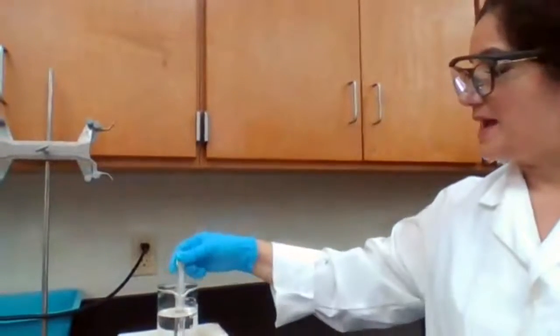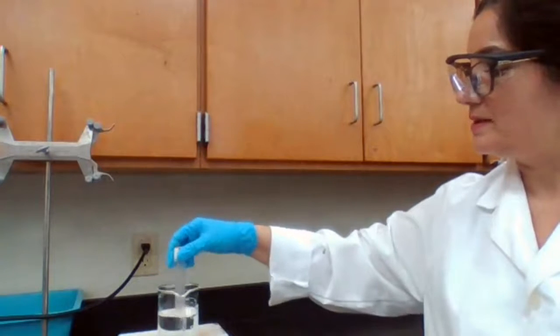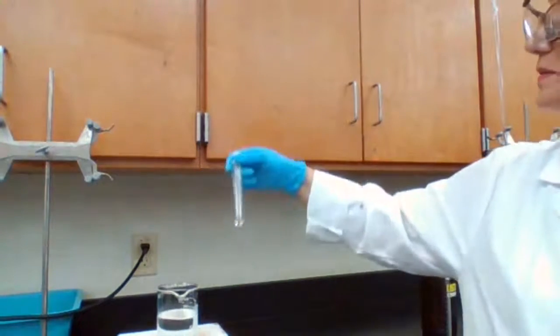We want to see what happens if we place the saturated ammonium chloride in the hot water bath. Now you're supposed to stir it periodically.